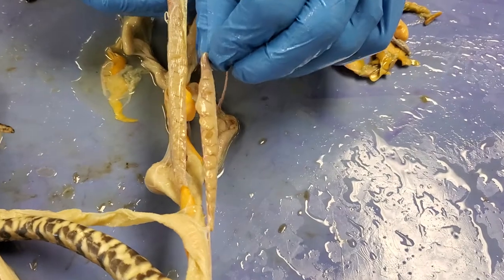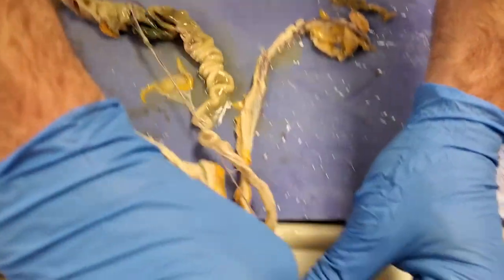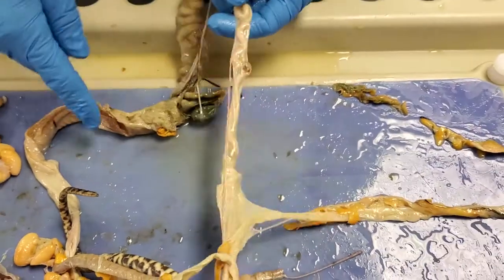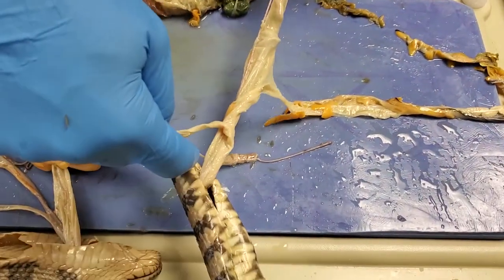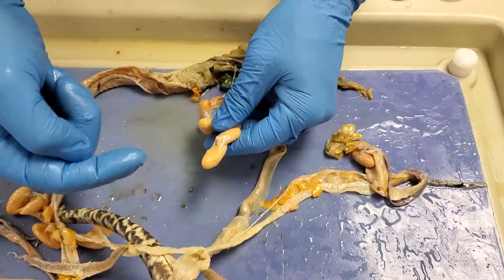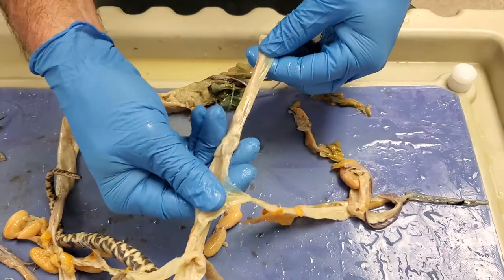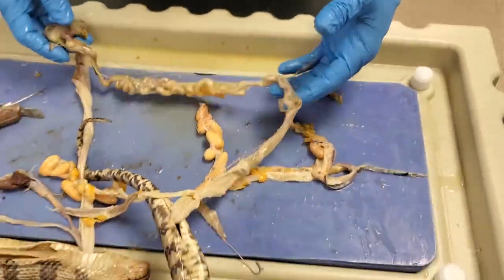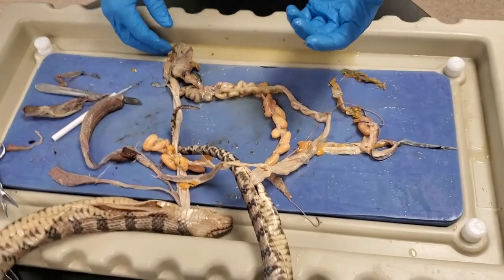There they are — you can see one kidney is higher up in front than this one. This is going to be the posterior kidney, and that would be the anterior kidney up in front of it. So the two kidneys there, and the rest of this in the middle is still intestine. So the snake, after it eats, processes everything, digests it, moves it on through, and poops out the cloaca. The kidneys let urine out through the cloaca, and these eggs would be birthed out through the cloaca as well. Does their small intestine have the divisions like the frog and like ours? No — there is no large slash small intestine; it's just intestinal tract all the way. Good question, Ms. Moyo. So that is your snake dissection — hopefully you learned something and thought it was kind of cool. Thanks, bye-bye.